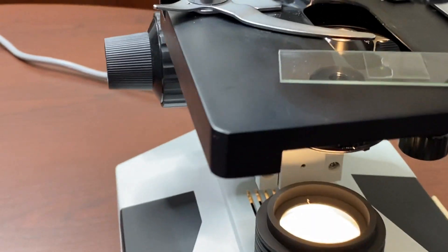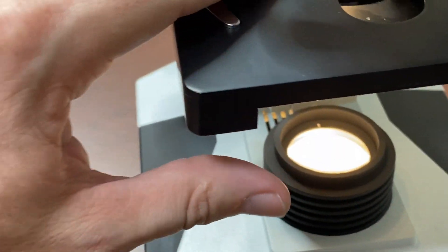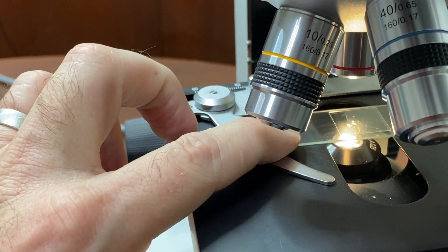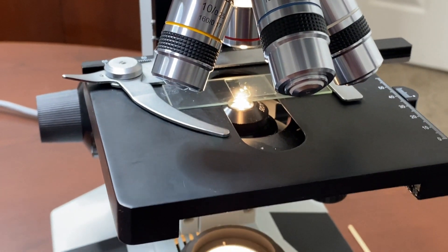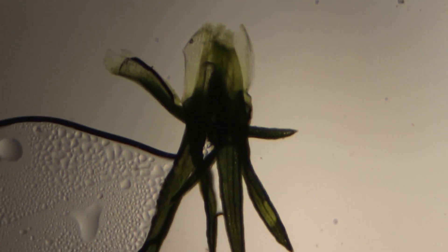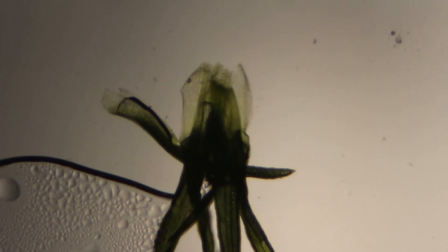So we're going to mount it over here. There we go. Alright, so this is the moss. This is actually the base of the moss stem. And I'm going to show you the whole piece of moss here. This is at 80 power. So 80 times the actual size. And it kind of gives you an idea.